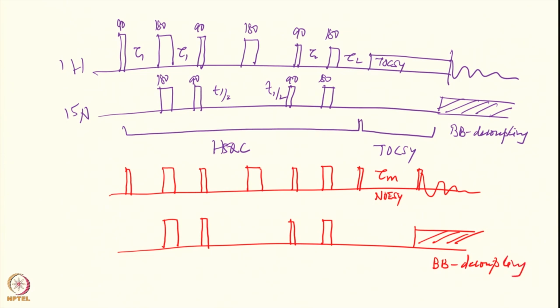So therefore it goes exactly the same way, except when we want to do the NOESY mixing, then you will have to use this sort of a modification in your pulse sequence, and you can adjust your tau and do it in the same way as you do in the normal 2D NOESY, or simply in the one dimensional NOEs. This depends upon the T1 period. The same conditions, same criteria are applicable here as well. So this is proton and this is nitrogen 15, and you get the relay information in the NOESY as well, and also the sequential connections. Okay. So this is the 2-dimensional experiments.